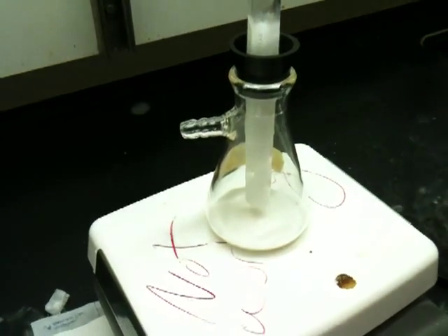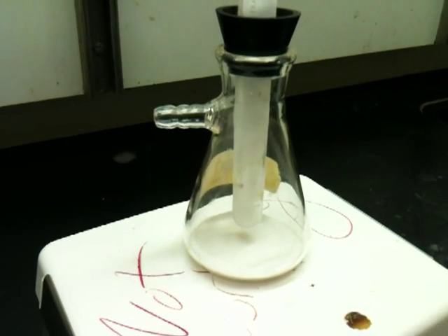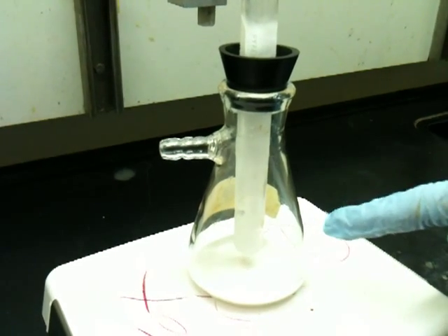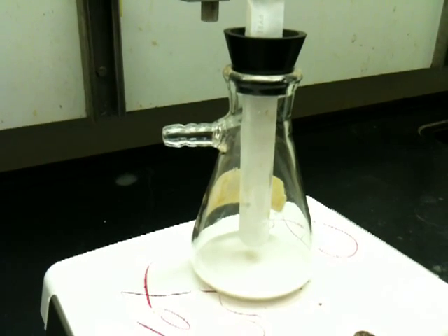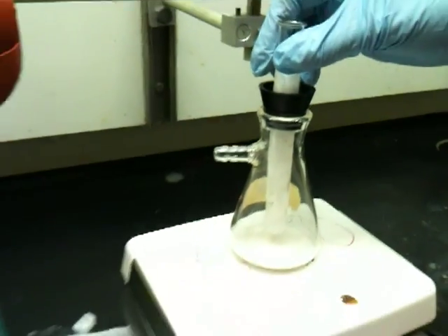What we discovered is that it's best, when the sublimation is over, to not try to get the compound off the finger right away. We find it's best to put this apparatus in your locker, let it sit for a couple of days, and let the dry ice just evaporate out of the tube. When you come back, the caffeine should be nice and dry, and you should be able to scrape it off the finger.